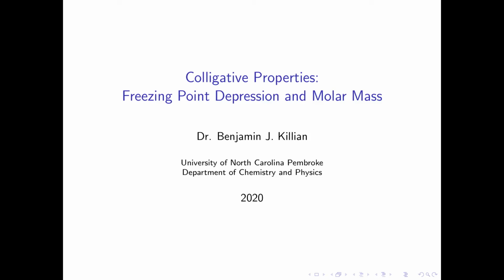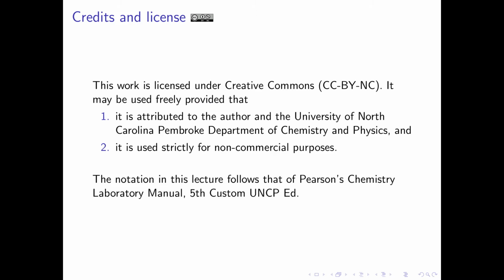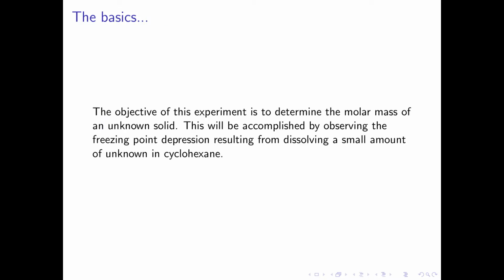Colligative properties, freezing point depression, and molar mass. The objective of this experiment is to determine the molar mass of an unknown solid. This will be accomplished by observing the freezing point depression resulting from dissolving a small amount of unknown in cyclohexane.